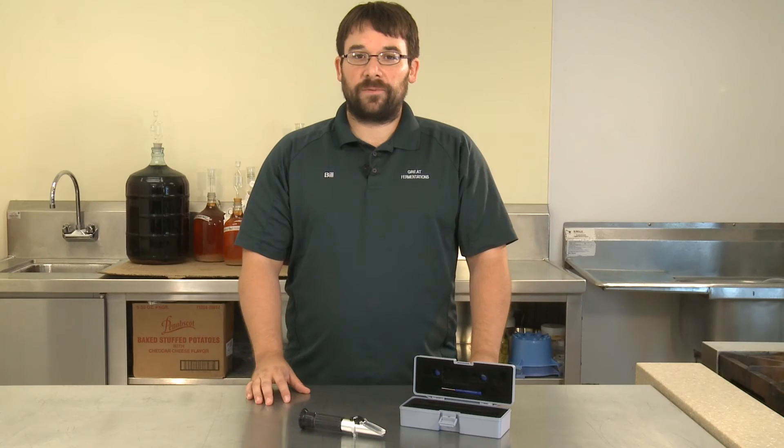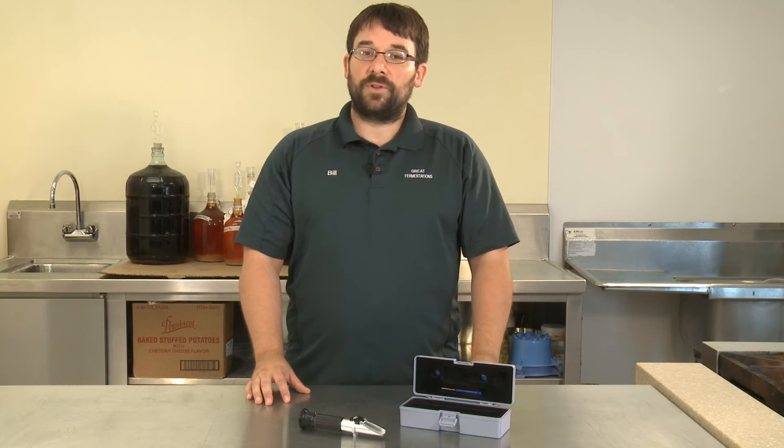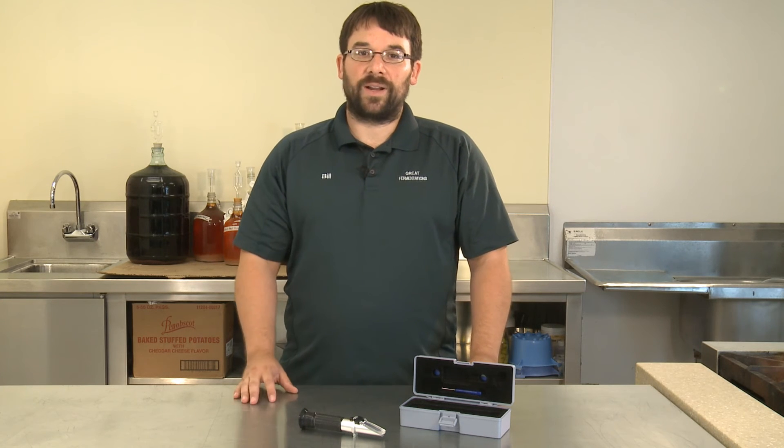Another great thing about the refractometer is that it's automatic temperature compensating, which means you don't have to cool down your sample before taking your reading.